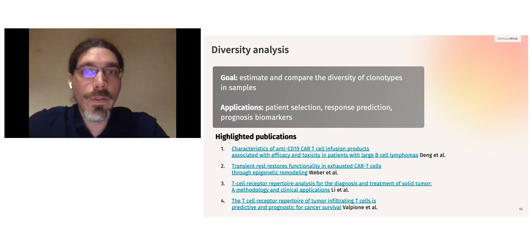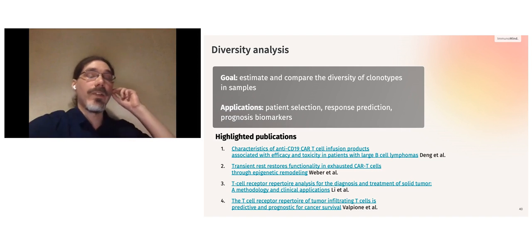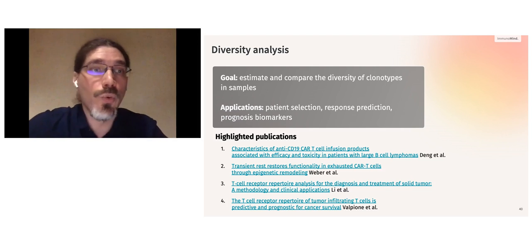Let's move to the diversity analysis section. After that, there will be one more very small section about gene usage segment analysis, and I will answer your questions about this section. So please feel free to write your questions about the clonality now.